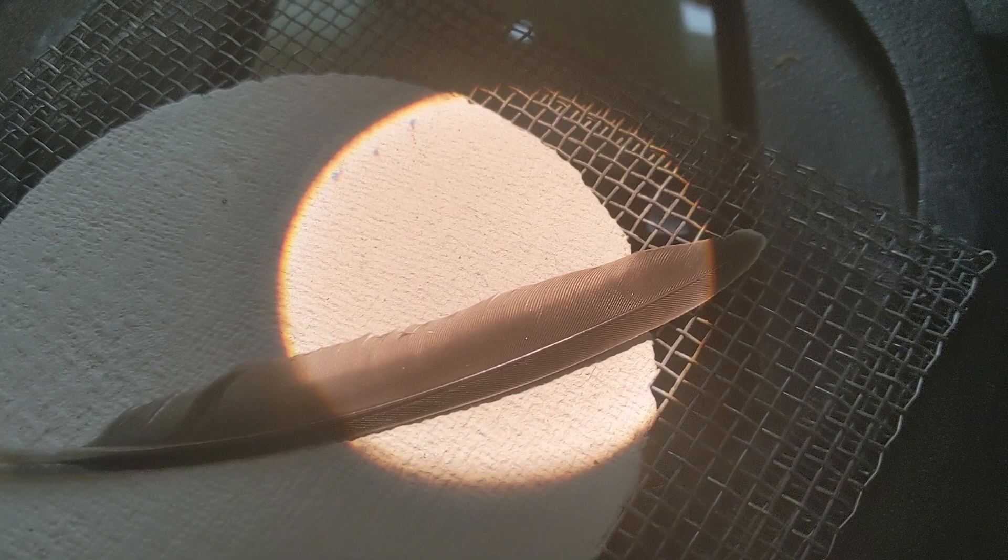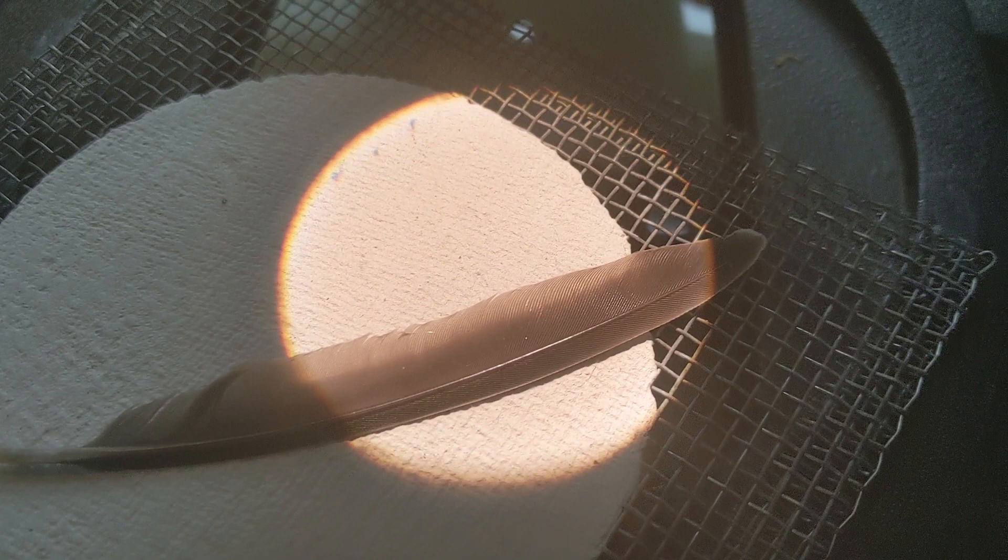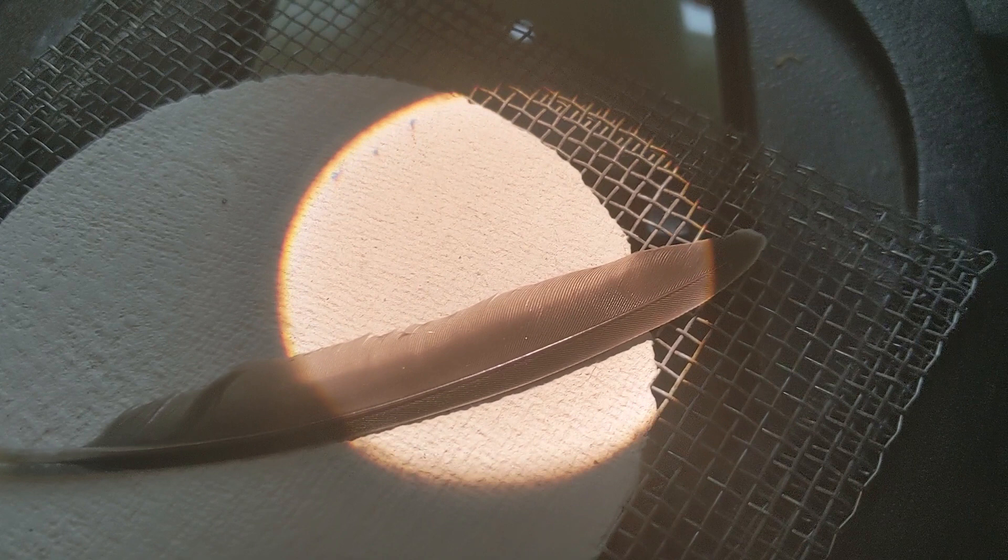It's actually much more off towards one side, and that is actually the leading edge of the feather, and this is designed for flight. It needs to be aerodynamic, and just like the wing on an airplane, it is going to be thicker at the front, and then it trails off and becomes thinner toward the back edge.